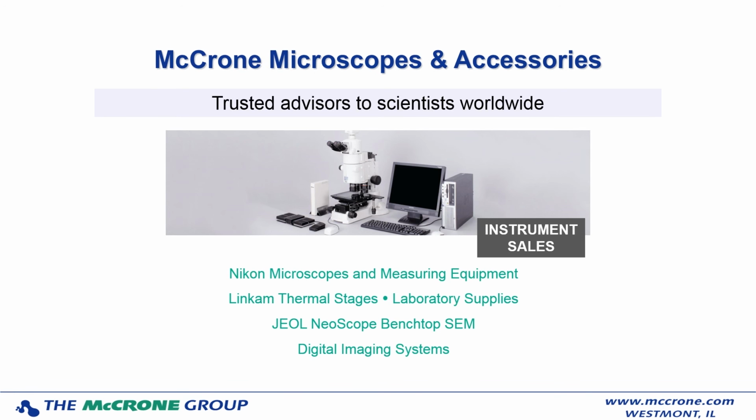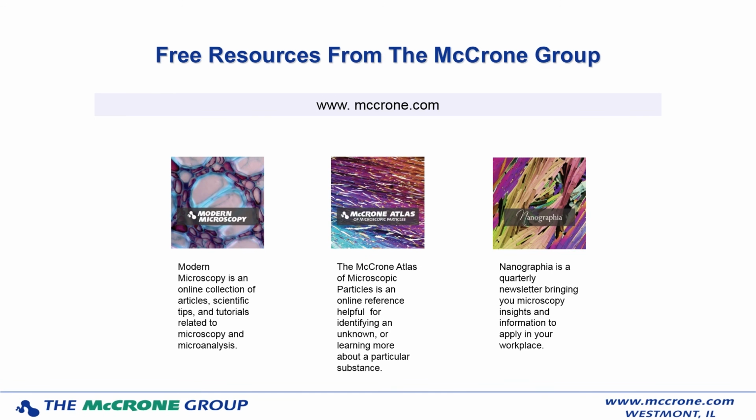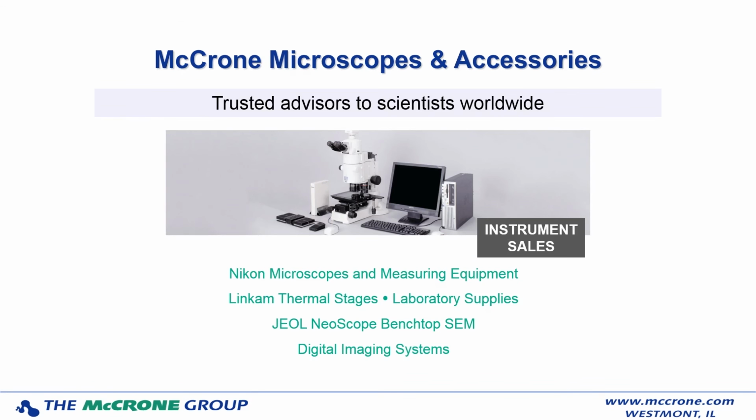Which method would you recommend to highlight transfer of metal from one source to another via contact? I presume you're talking about transfer of material from metals as they make contact, if they're scraped against each other or something like that. You would certainly look at it with light microscopy first. That's usually the first thing we would do. Then, if you can get it into a scanning electron microscope, you can get more detailed information, and perhaps some elemental analysis of material that has been transferred from one to the other, to try to verify whether that material was consistent with that metal having touched it.